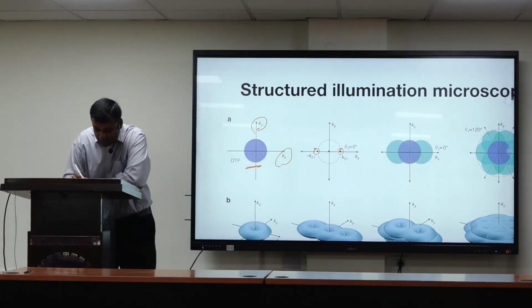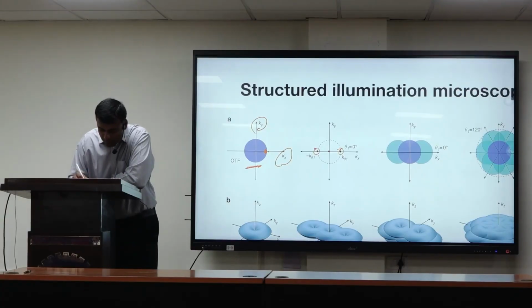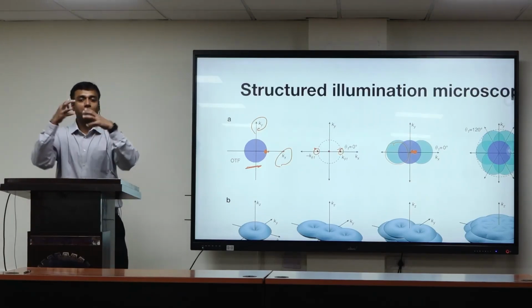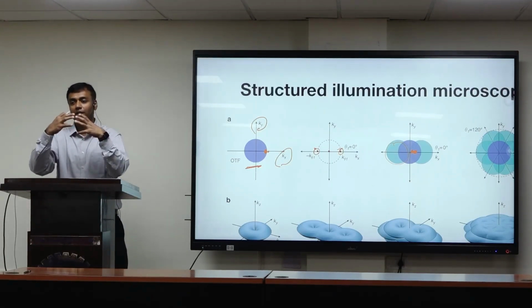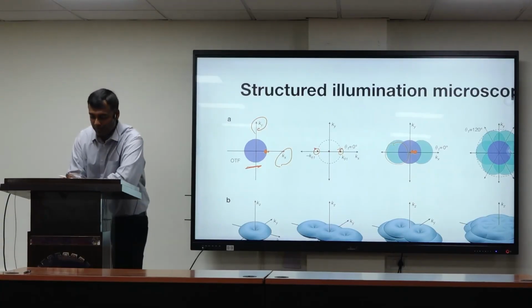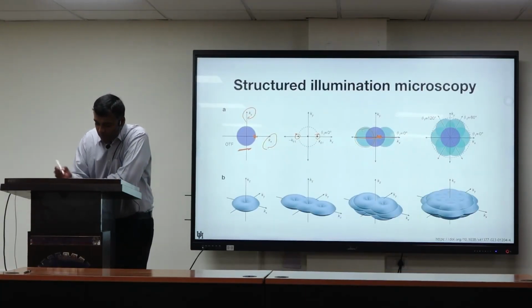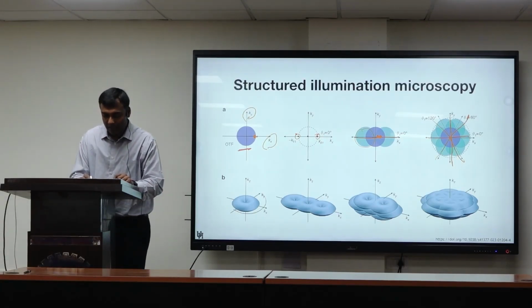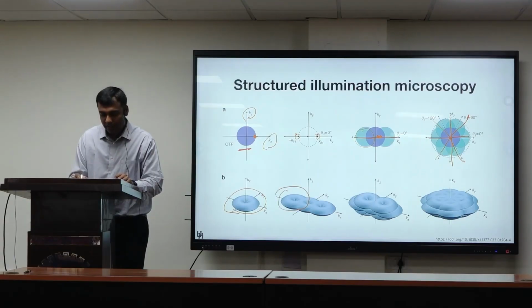What was previously high frequencies over here become inside the measurement Fourier domain. Similarly you shift it along this direction, this direction, this direction. So you collect this data, this data, this data, this data.